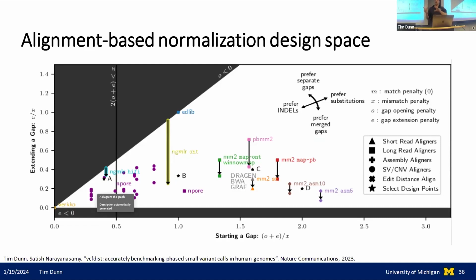However, I wouldn't necessarily recommend normalizing the variant representation in those regions using the default parameters in this tool, because changes in the copy number of those short repeated sequences are much more expected to happen in those regions. But yeah, it can still be used for evaluation and benchmarking in more complex repetitive regions. The main limitation that we have right now is it doesn't really do anything much larger than 10 kilobases, just due to memory requirements at the moment.